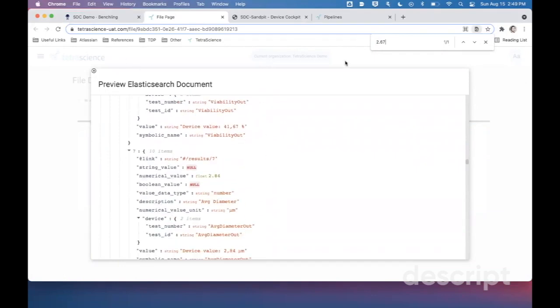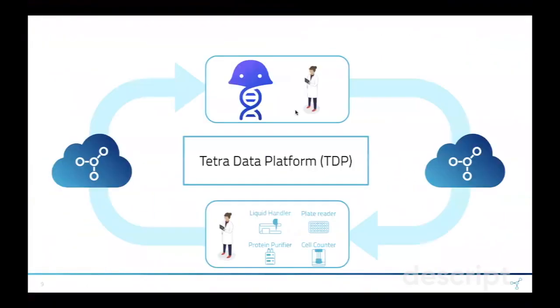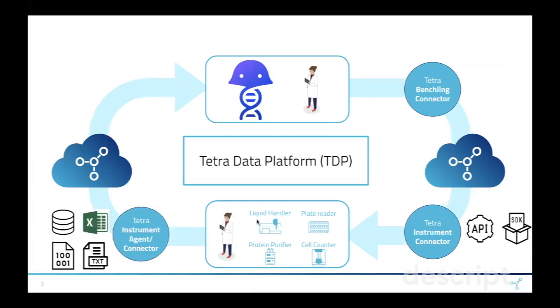And so if I go back to the slides, I hope I've shown you that using our platform, we can use these connectors to get data from ELNs and use our instrument library to get that data into various instruments, and then automatically parse that data into our intermediate data schemas and upload that data back into Benchling.